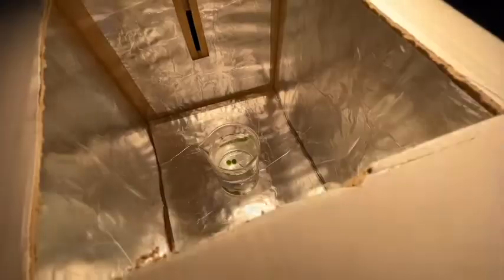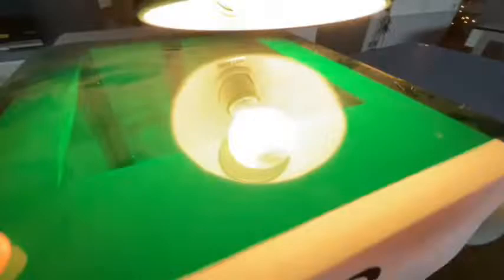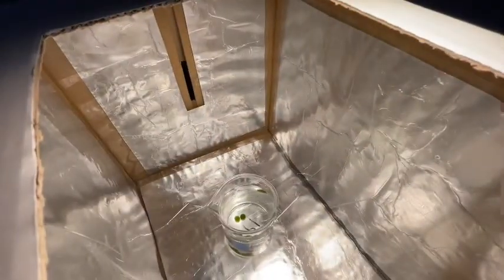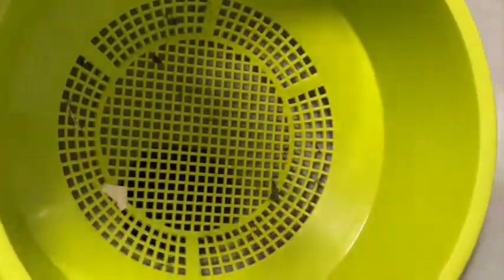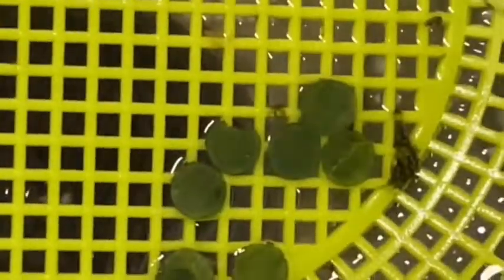So you want both experiments running at the same time. Now that students know how to perform this experiment, they can use other variables to test. Like if I use a green filter, does green light make the leaves rise to the top as much as red does? So I could use a red filter, a green filter, all sorts of things. They could design different experiments with those. When they're done, I have students pour the water back through a filter so that they can collect the leaves.